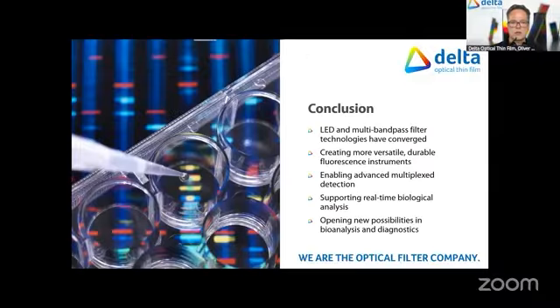So, conclusion of my presentation. We have seen developments of LED and multi-bandpass filter technologies. These two have converged in the past years and now enable really advanced fluorescence instrumentation solutions that can enhance your application in microscopy or diagnosis. It's very versatile, it's very durable, and enabling multiplex detection of any combination of fluorophores, and so enabling real-time biological analysis. And I think that will open up new possibilities in analysis and diagnostics in biology.